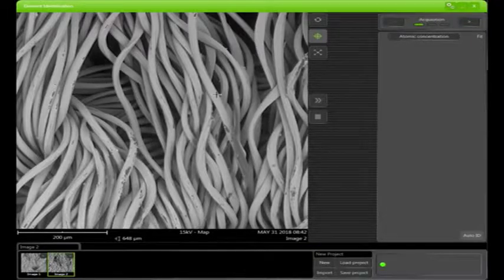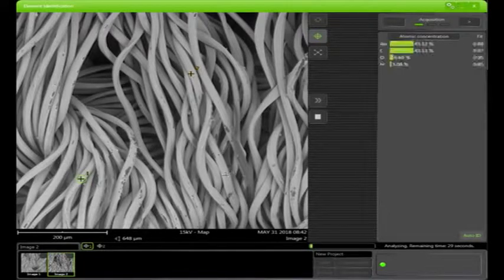There we go. A couple of errors popped up, but they were inevitably irrelevant. I had an earlier image from a previous test, but we'll focus on this one. You have a couple of options for elemental identification with EDS here. First, you can do point analyses, pick a couple of points, and get an elemental breakdown. This is some sort of organic that's sputtered in gold, so we're seeing primarily carbon and gold in the top right here. So these are point identifications.